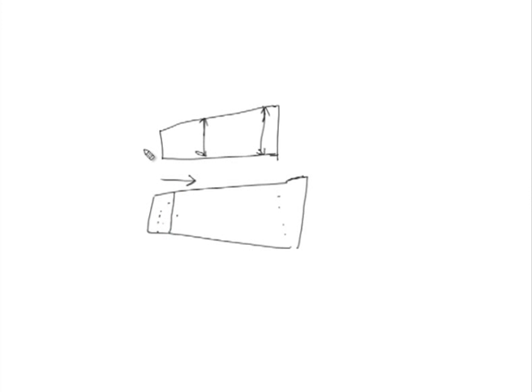This boundary acts as a lens and a refractive index gradient occurs, where you have more concentration here as compared to here. So, as this boundary moves, the peak also moves.